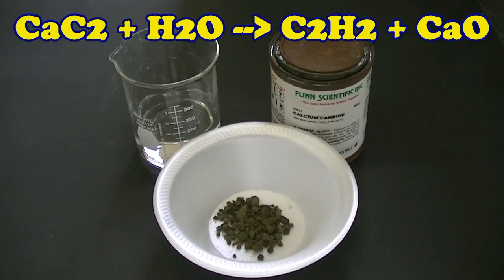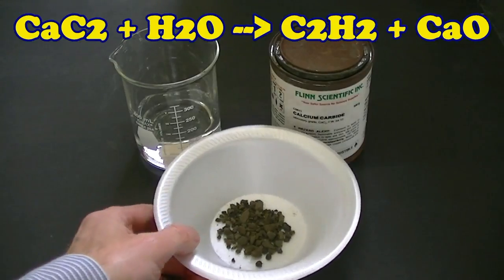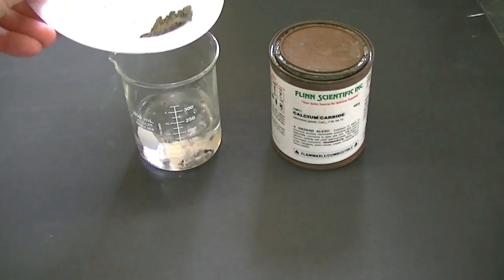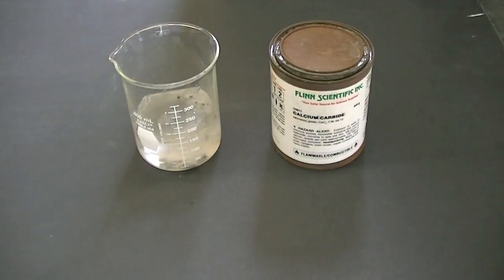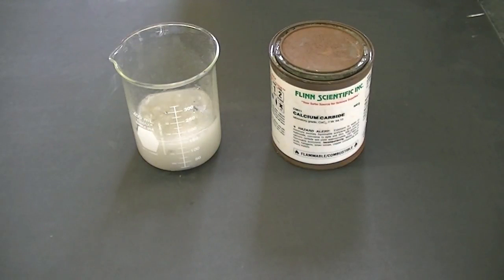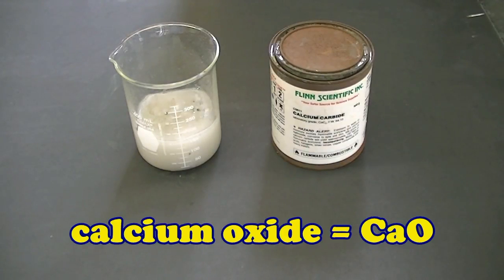Calcium carbide reacts with water to form acetylene gas and calcium oxide. Let's watch this reaction take place by adding some calcium carbide to water. Notice the formation of bubbles, which indicates the formation of acetylene gas. Also, the cloudiness you see developing is due to the formation of calcium oxide, which is white in color.